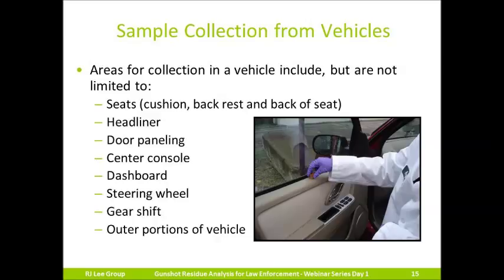When sampling from a vehicle, consider the flow of an incident before collecting. So what I mean by this, if a potential shooter fired a gun out of the driver's side window, you would want to collect samples from the driver's door before you collect samples from, let's say, the passenger seat or a rear passenger seat. Another thing to consider is the material of the surface that you are sampling from.